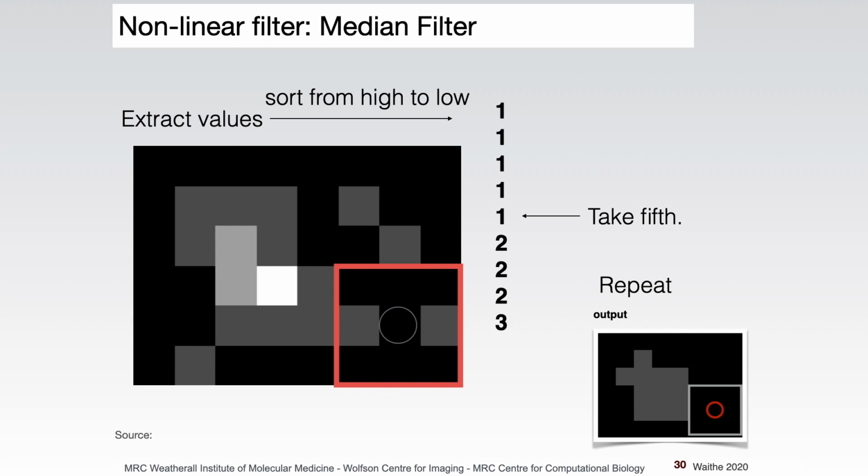But hopefully on a large image, it's not a very large area, so you can almost just write off that part of your image and not worry about it too much. But you definitely have to think about it if you're working on very small samples of images, because you'll notice that the pixels around the edge can behave a bit weirdly in your output of your filter.